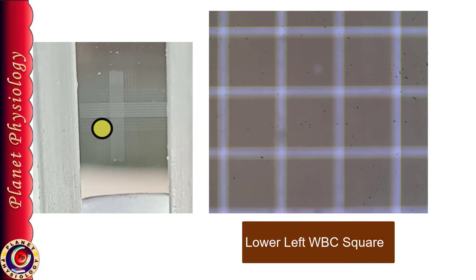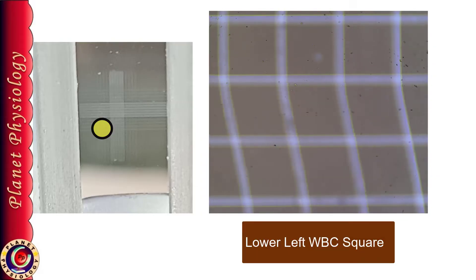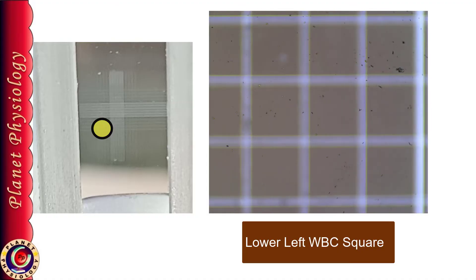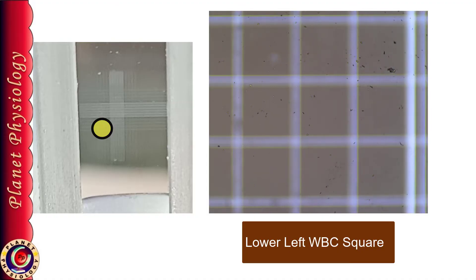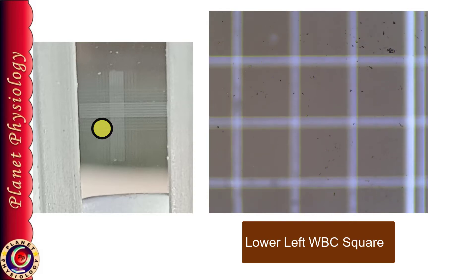Here I can see squares under low power. It means I have reached to the lower left corner WBC square. Once you are in any corner, you can either proceed further in the same direction or you can move sideways to get the another square. So I am moving upward further.